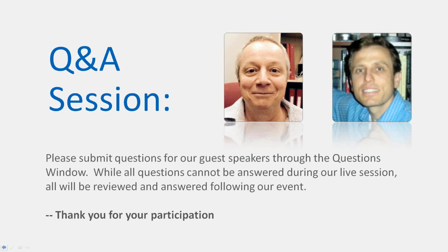Yeah, I was going to say it's great that you touched on pancuronium, because we had a question come in from Julie Harrell, and she mentions experimenting with this. So that's maybe something to consider. Experimentation is fine, but think about the consequences, especially when using drugs, and how this might influence hemodynamics. On the same talk about ventilators, certainly from a physiological point you approached answering that question. One thing I would share from my experience as well is that not all ventilators are the same, and there is some experimentation there. There are different models, and Pete, you touched on this, right?